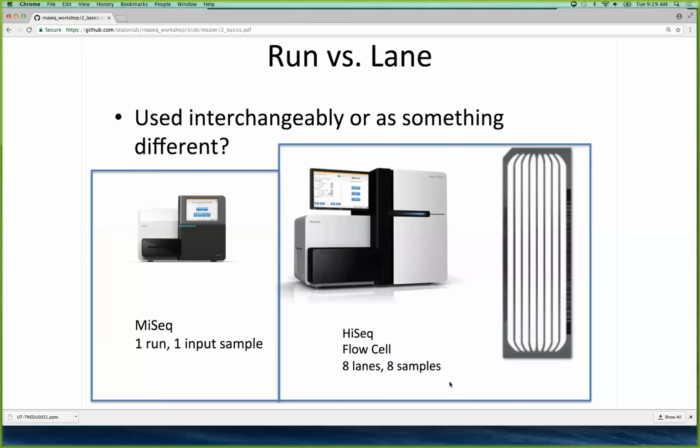But in this paper, he tried it, and he sent me 10 libraries, and they were complete crap. They were awful. The reads didn't map to the genome. They were low quality. But it gives me hope that if somebody sits down and optimizes that, we can get cheaper RNA library preps. But right now, as far as I can tell, it's still worth it to pay for the real deal.